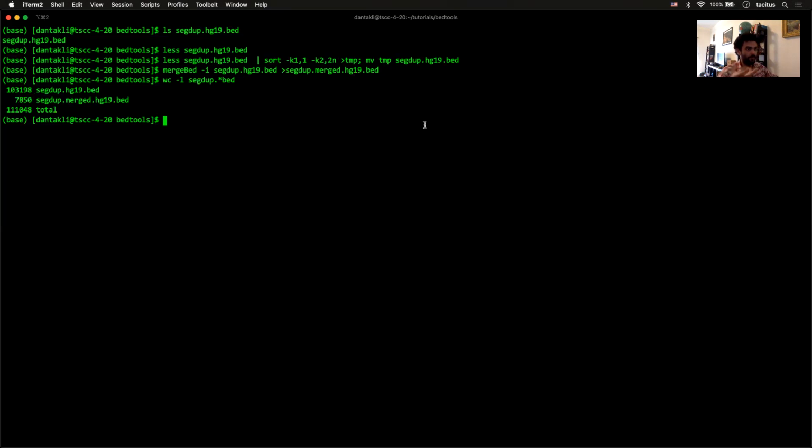Okay, so now let's get to actually filtering these. So you do bedtools intersect. You give the A file. Here we're doing 1000 Genomes Omni HG19 bed. And Bedtools can take the .gz or the .bed. It can work with both. And now we're going to give the seg dupes merged. We can give the sorted option because it'll run a little faster. I mean, this runs pretty quickly.